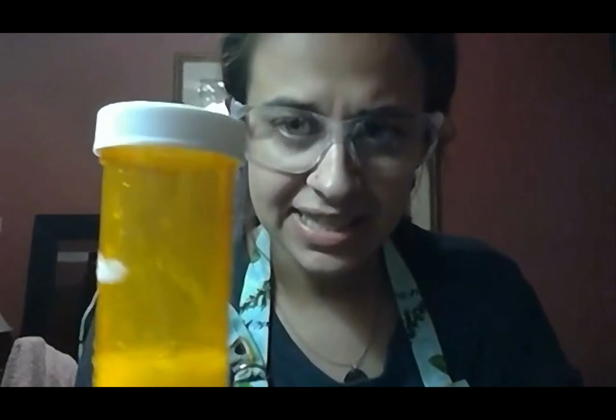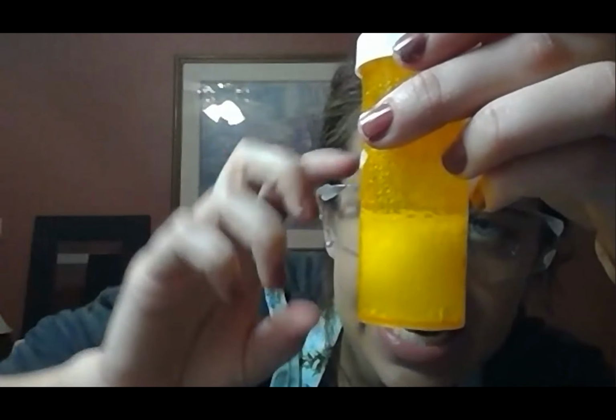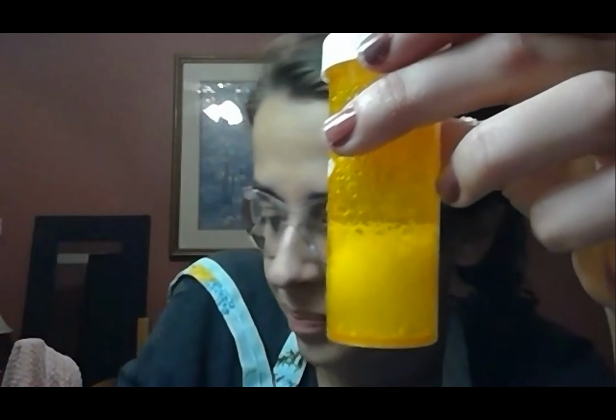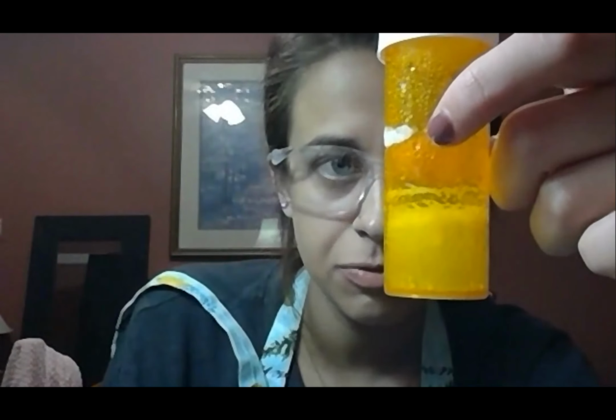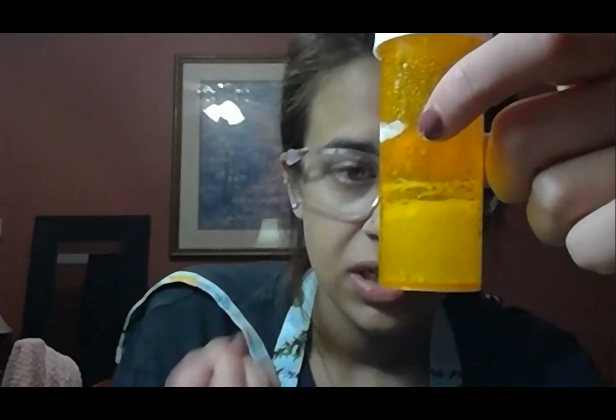You again can see that this reaction is happening quicker than the first one. We see that our bubbles are going up higher. We see that it just happened generally quicker. So again, I guess this reaction isn't having enough momentum in the gas bubbles to blow the top off.